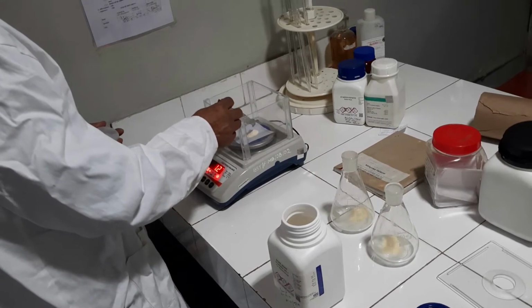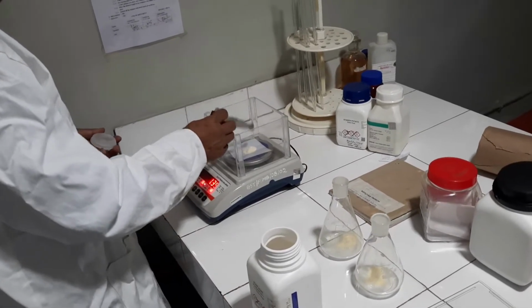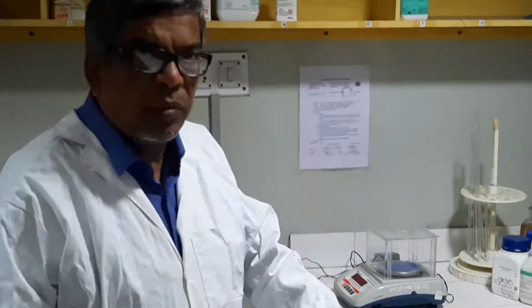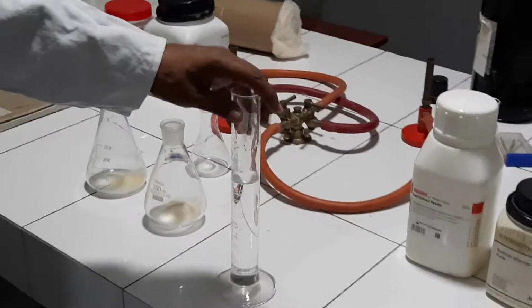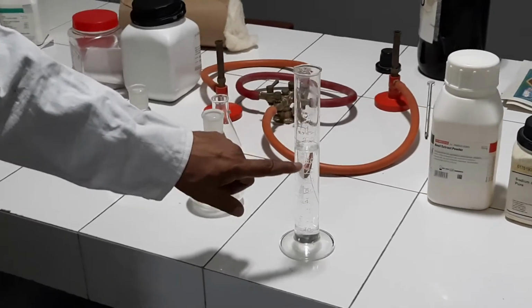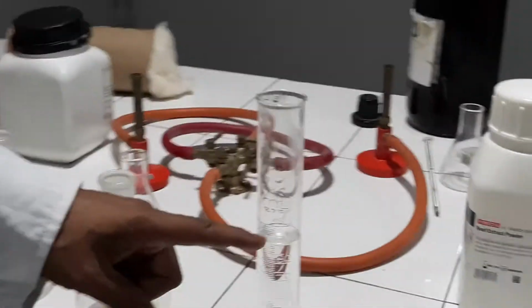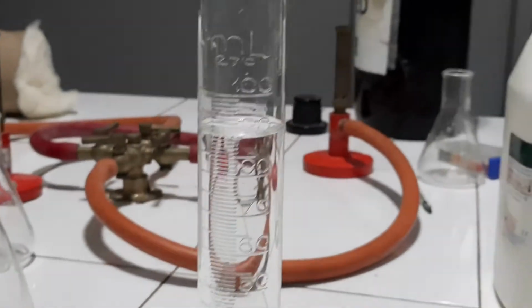Solids are of different occupation. So I have taken less than 100 ml. Our target is up to 100 ml preparation of the medium, and I have taken about 90 ml of distilled water. Why? Because solid will occupy some space and volume would be made up to the mark later on. So this is 90 ml.